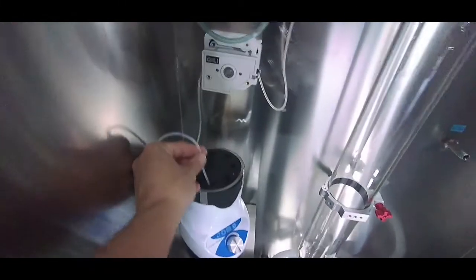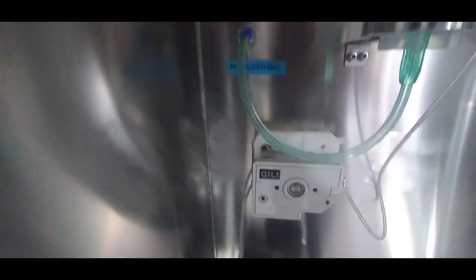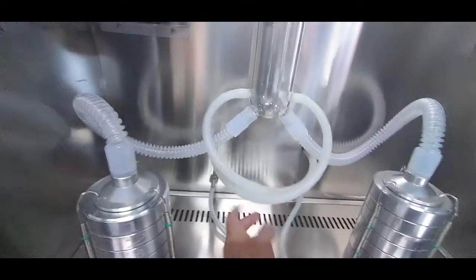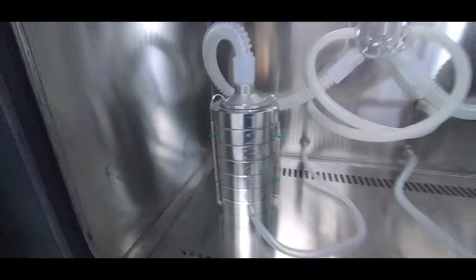The peristaltic pump goes into the test tube with the bacterial culture — that's the peristaltic pump — and it feeds it into the nebulizer. These two go here: gas in, and on the bottom you have the gas out coming here into each one of the petri dish towers.